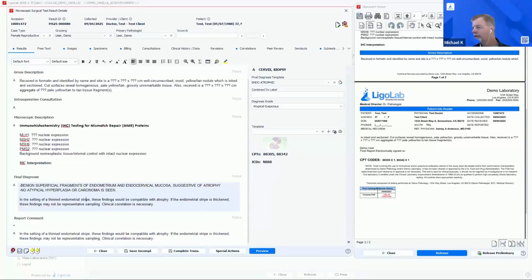One more here, digital pathology. Does the platform integrate with digital pathology solutions? We do. On the technical side, it's treated like any other interface, like you might have with the stainer or any other device within the laboratory. For laboratories that have this set up, typically when this window is first opened, similar to how the report preview opens side by side, it'll also send a message so the viewer will open side by side.